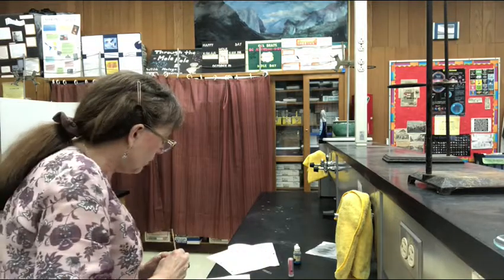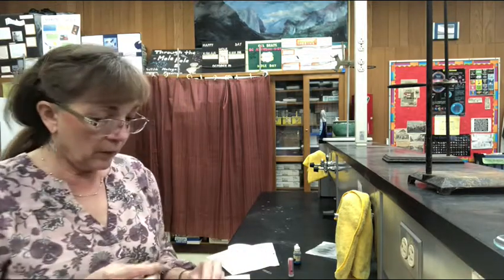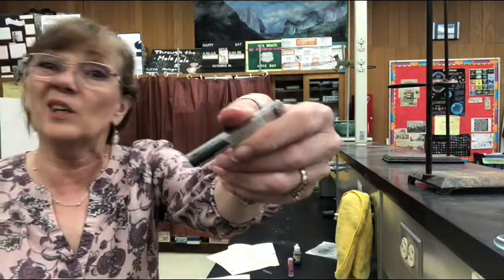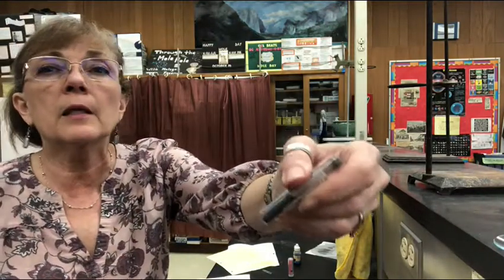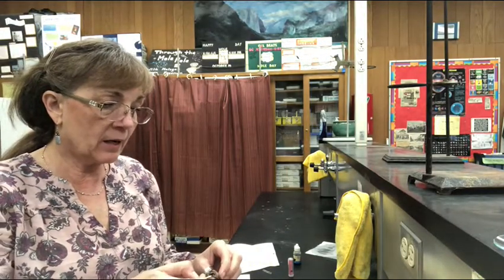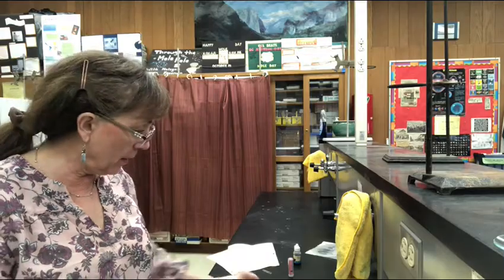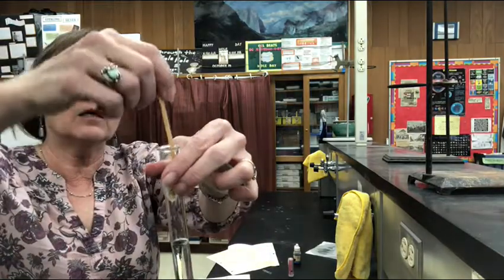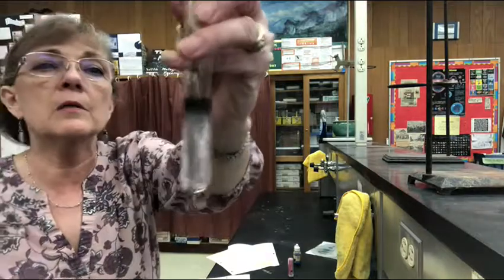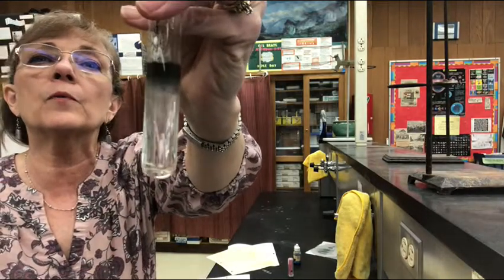And this catalyst, remember catalysts go over the top of the arrows. This catalyst is a black powder. Doesn't look like much either. It is manganese dioxide. I'm just gonna put a tiny amount into my test tube. And pretty quickly, you should be able to notice that there are bubbles forming.